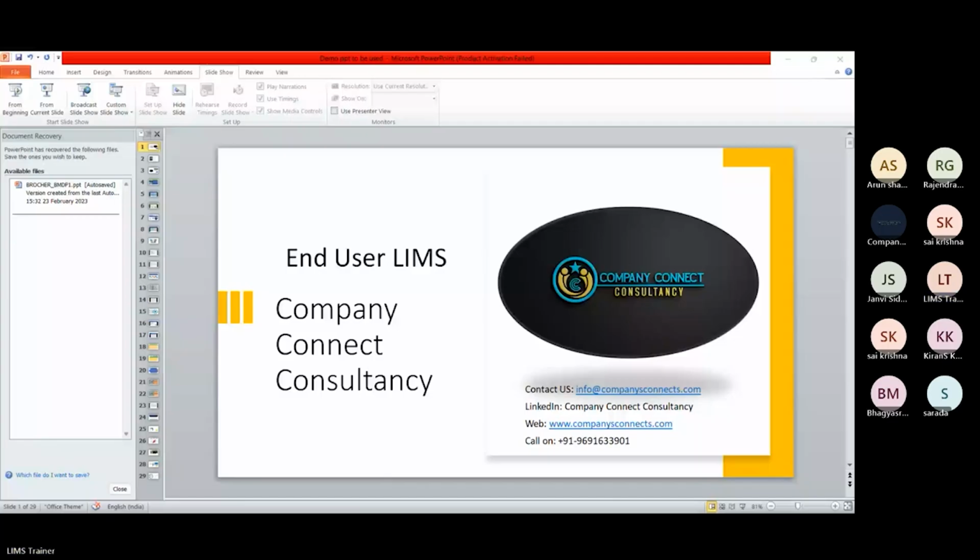Then in the 1990s, personal computers were developed, where LIMS moved from minicomputers to personal computers. Some of the paper and pen activities were dissolved there, and this evolved era helped improve things in the future, like what we see in today's industry, the 21st century, where all the activities in the laboratory are controlled and managed through laboratory information management software.